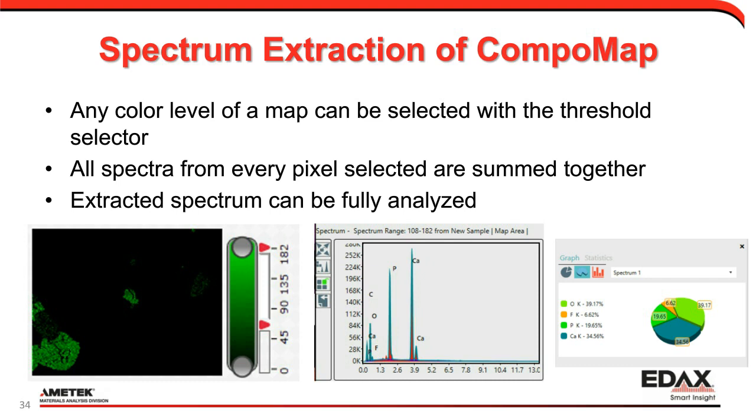And I was really happy to see this fluorine peak here, because this was a pretty quick map collection, a high resolution map, and fluorine is a pretty challenging low energy material. But we have this nice healthy fluorine peak there, as well as the clear fluorine concentration displayed for us.